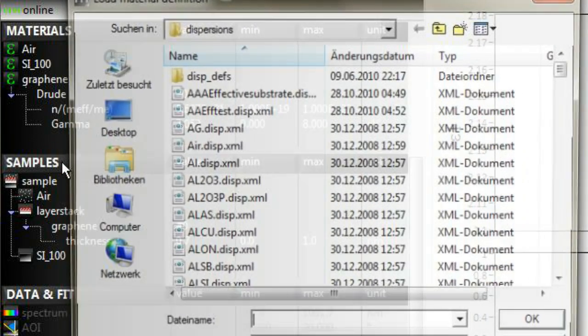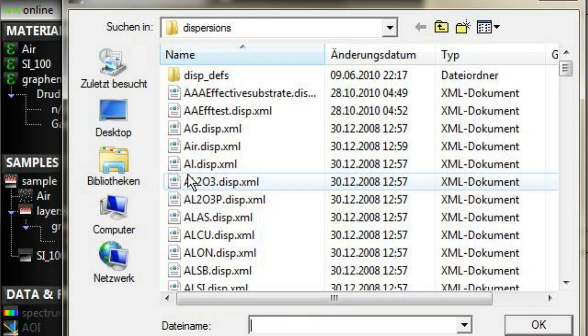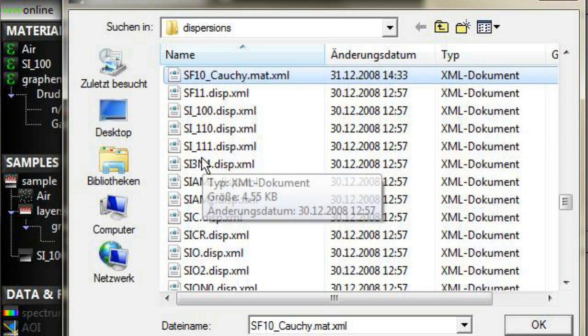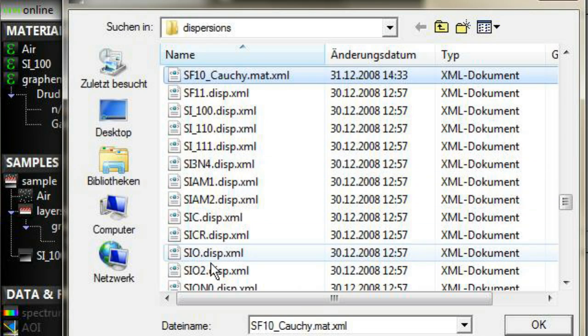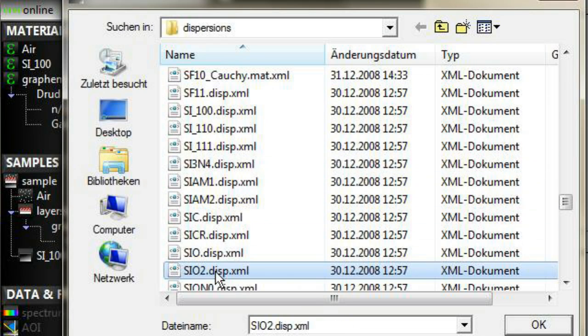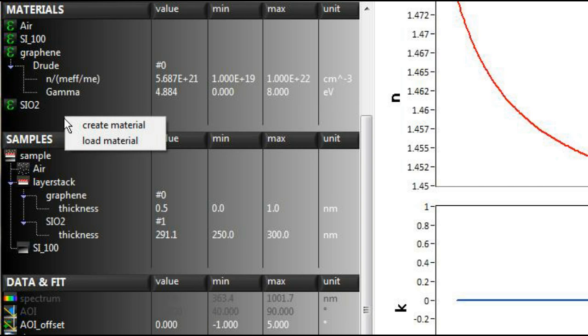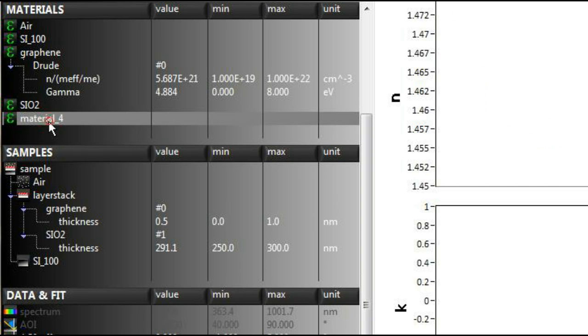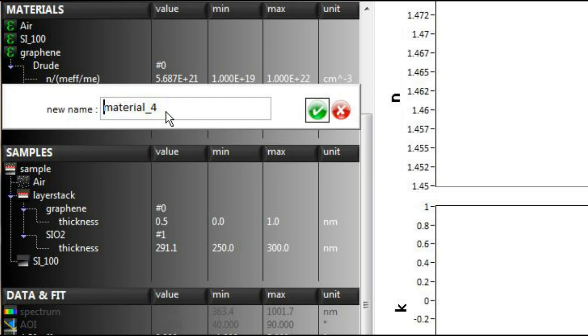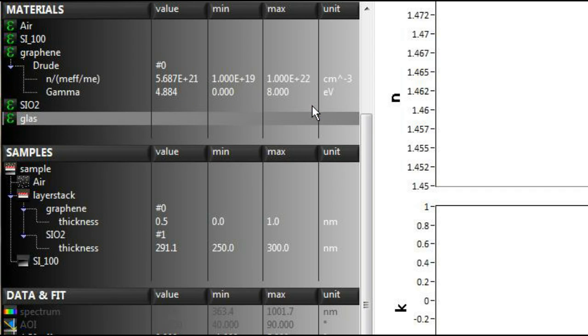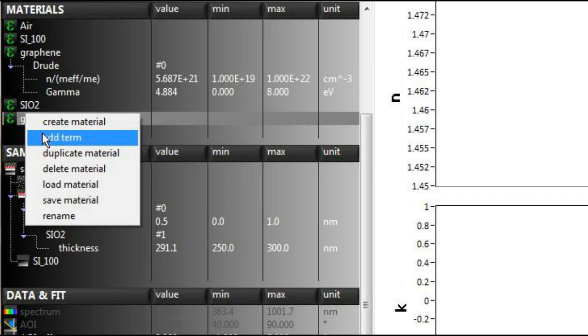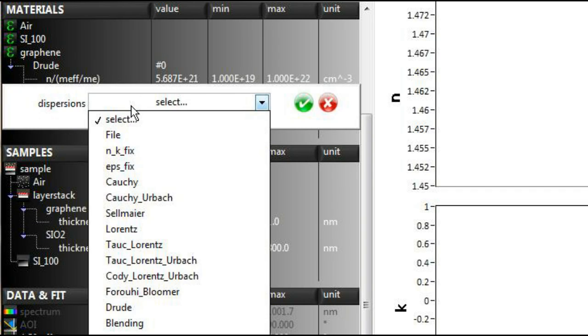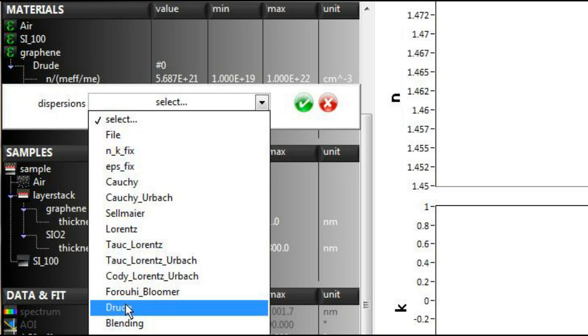In the material definition section, you may load materials from a database. Or you may create your own material definitions. For self-defined materials, a number of dispersion functions as well as effective medium approaches are available.